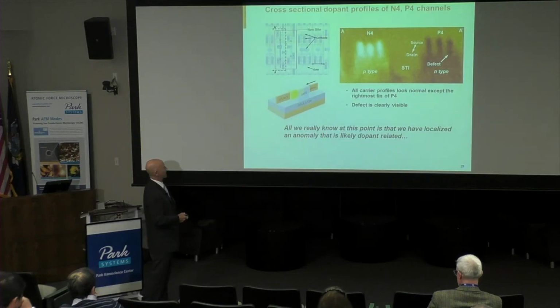Because really, we're trying to remove atom by atom, and we don't want to overshoot our target. So this was a testimonial to the skill and patience of my colleagues who prepped this sample, because it was a very long, tedious effort to do it. But they were successful.